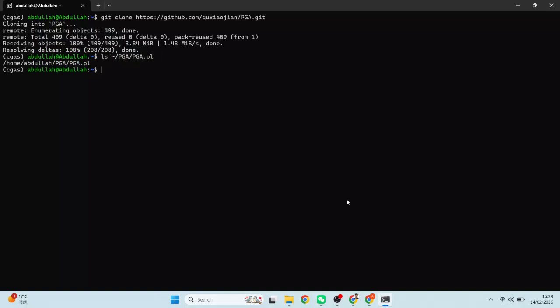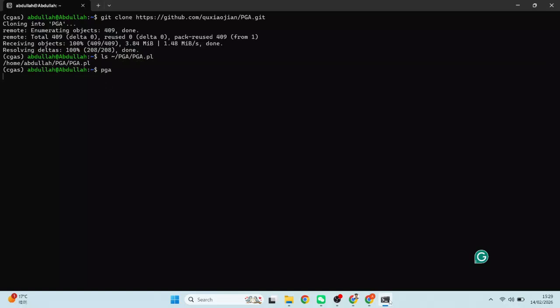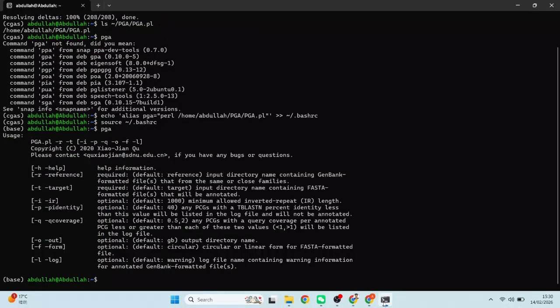Now we will list the PGA and find the path of the PGA. When we give the PGA command, we find nothing. Now we will install the alias. Now after installation, we can see the PGA is successfully installed.